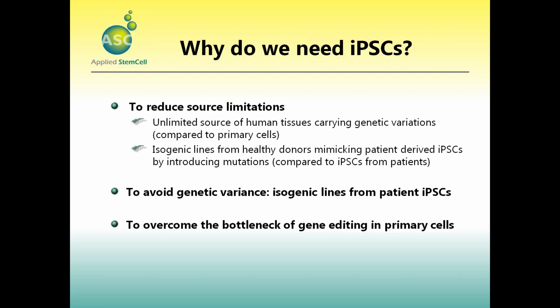One more important consideration is that iPS cells are relatively easy to handle and to be genetically modified compared to primary cells. We all know that primary cells have a short lifespan and incapability of single-cell cloning. iPS cells allow the edited gene to exist in lineage cells.